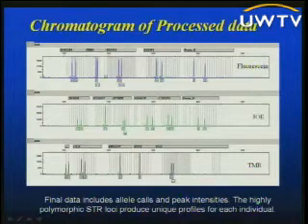So if you just look at this individual, you can tell that at all of these loci, this individual is a heterozygote. Below each peak, it indicates what allele this individual encodes at these loci. There's some loci at which this individual is a homozygote, as you can see, at this locus as well as this one and this one. But over the majority, he or she is a heterozygote. And this is a typical profile for an individual with no mixes.